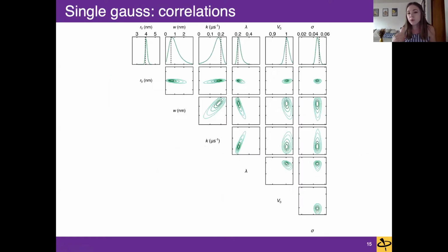Another important takeaway of this method is that it allows a full characterization of the uncertainty, not only through these posteriors, but also through pairwise correlations of all parameters. Here I'm showing these correlations only for the poor case, where the breadth of these plots indicates the confidence of the method, and a skew from a vertical or horizontal axis indicates the degree of correlation.